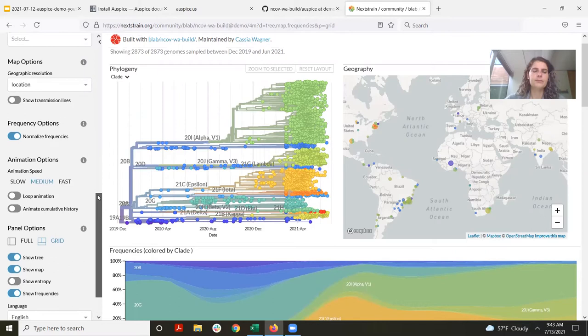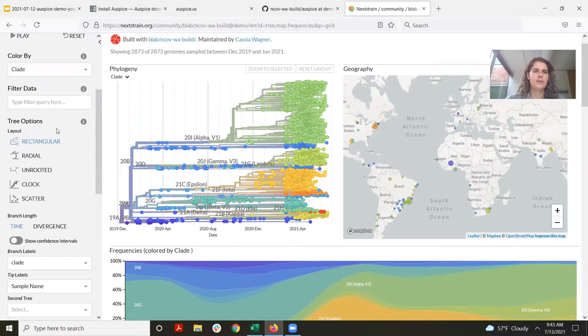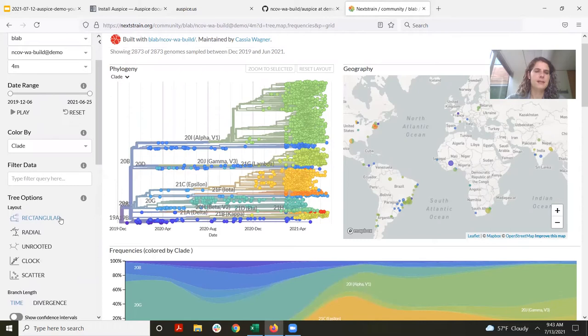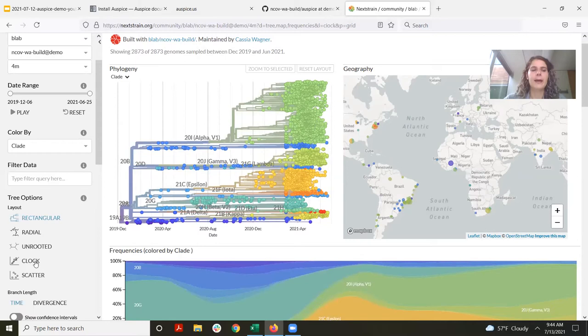In this toolbar, you can also see a number of tree options. I can display the phylogenetic tree in various ways — right now I'm showing a rectangular phylogenetic tree, but I could also show a radial tree or an unrooted tree. We also have clock view and scatter plot view. I want to show clock view because when I build a tree, this is something I'll go to right away, as it can be really helpful for quality controlling your sequences.